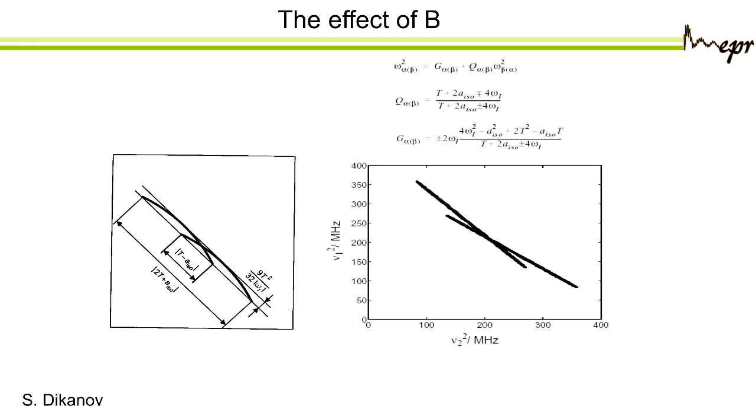And if you have good resolution, then if you measure this curvature, you really can extract the anisotropic part. You see here that from the total ridge you can get T and A-iso, but from the curvature you can get T, and this is very important because sometimes it's not easy to separate the isotropic part from the anisotropic part, and here you get immediately a number that is related to B. It has T squared in it, and from this T squared you can immediately get the distance.